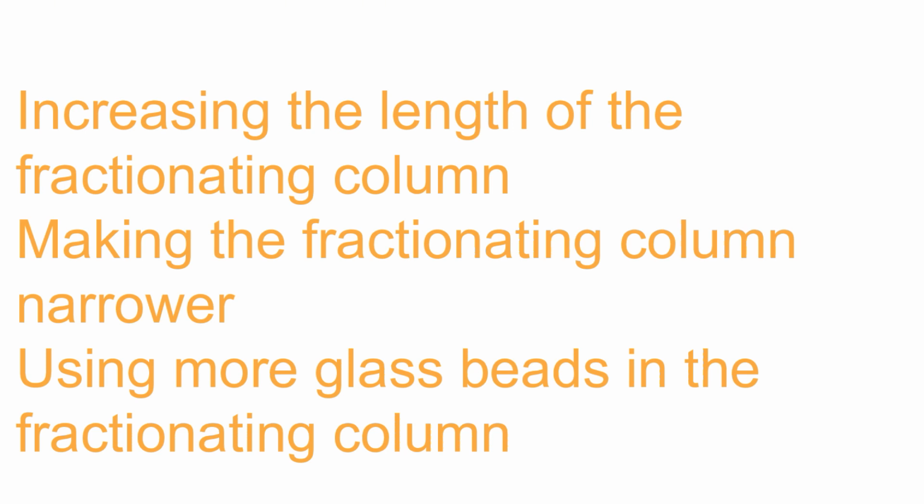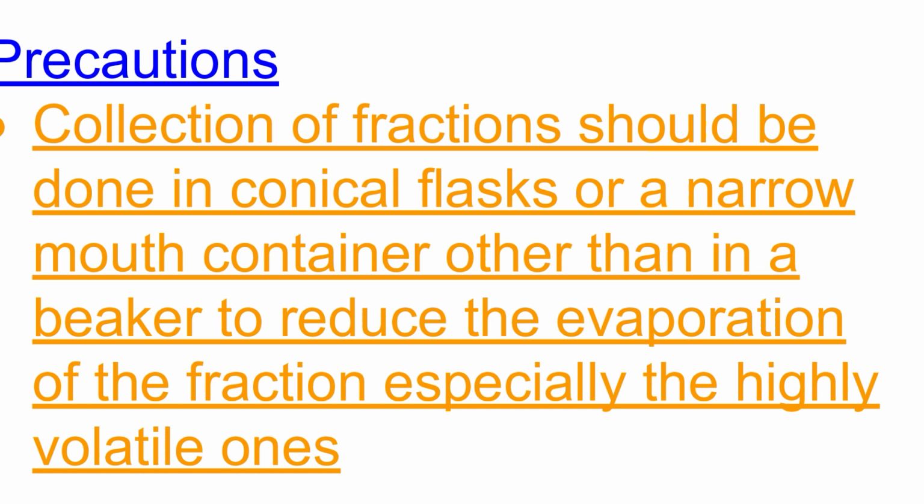Some of the precautions to be undertaken during the fractional distillation are: 1. Collection of fractions should be done in conical flasks or a narrow mouth container other than in a beaker to reduce the evaporation of the fraction, especially the highly volatile ones.